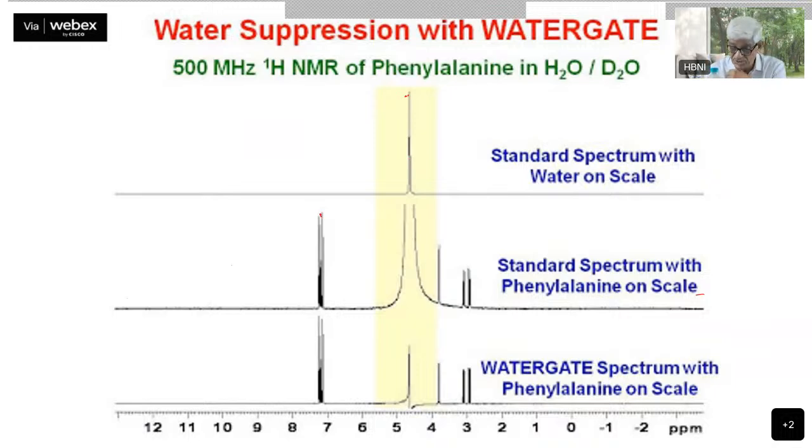Okay. Now what you do is you do water gate suppression with phenylalanine on scale. So you look at the water signal where it has come.